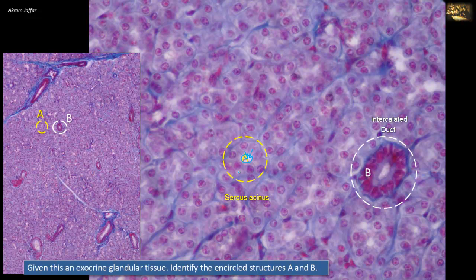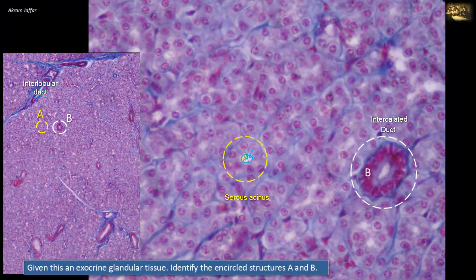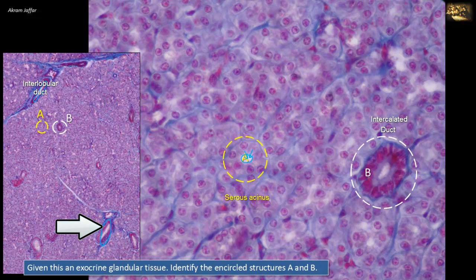B is an intercalated duct present among the acini. These ducts become larger and larger, forming interlobular ducts present in the connective tissue separating the lobules of exocrine glands. The lining of the ducts is a cuboidal epithelium with a distinct lumen in the center. Larger ducts in the connective tissue are accompanied by blood vessels, which are lined by endothelium rather than cuboidal epithelium.